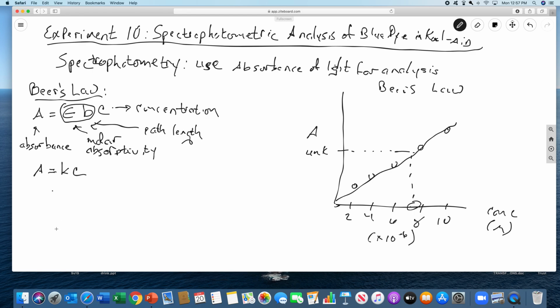So this is a nice picture in a lab manual of this. They typically have like a light bulb, light source. That's a bad light bulb. And then that light bulb will hit something like a prism or a diffraction grating, and it breaks the light up into its component wavelengths. Red, orange, yellow, green, blue, violet. That goes up against a barrier, and the barrier has a little slit that goes through. This light is called the incident light, I0.